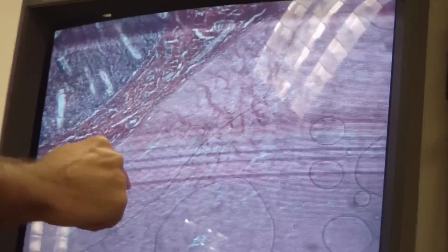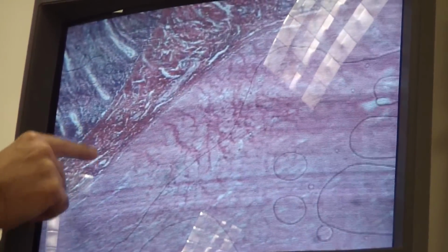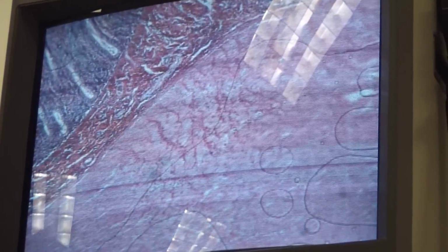Remember, this is the mucosa with those villi, and that's the lumen right here. Since in here I can see those Brunner's gland, and here again this is the muscularis externa, circular and longitudinal, and then serosa. Since I see this Brunner's gland, that should be duodenum.